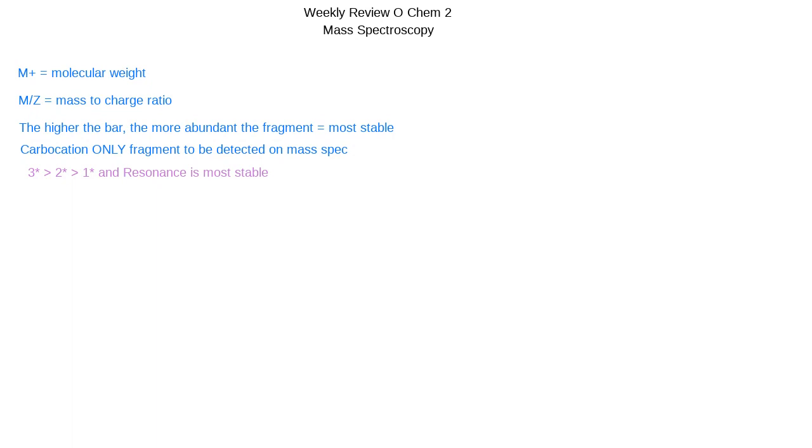I will give you some examples of mass spec problems and how to solve them. First we have this structure.